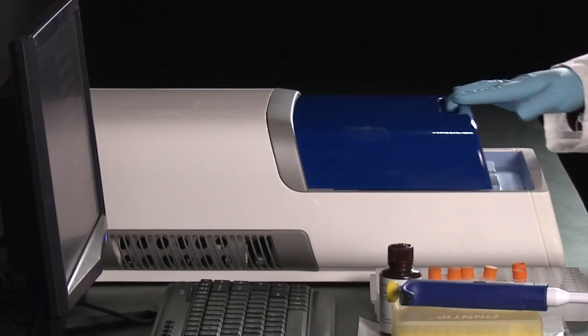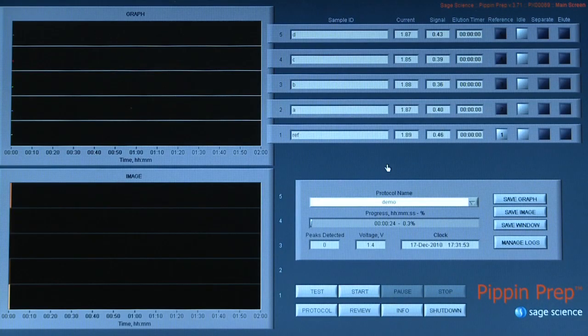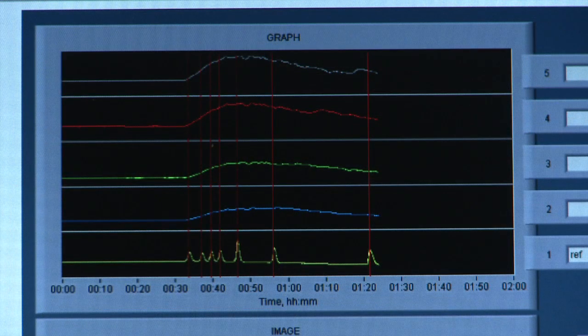Close the lid and press Start to begin the run. The Pippin will run for between 50 minutes to 2 hours depending on the cut size. At the end of the run you will see profiles of your reference ladder and DNA samples.